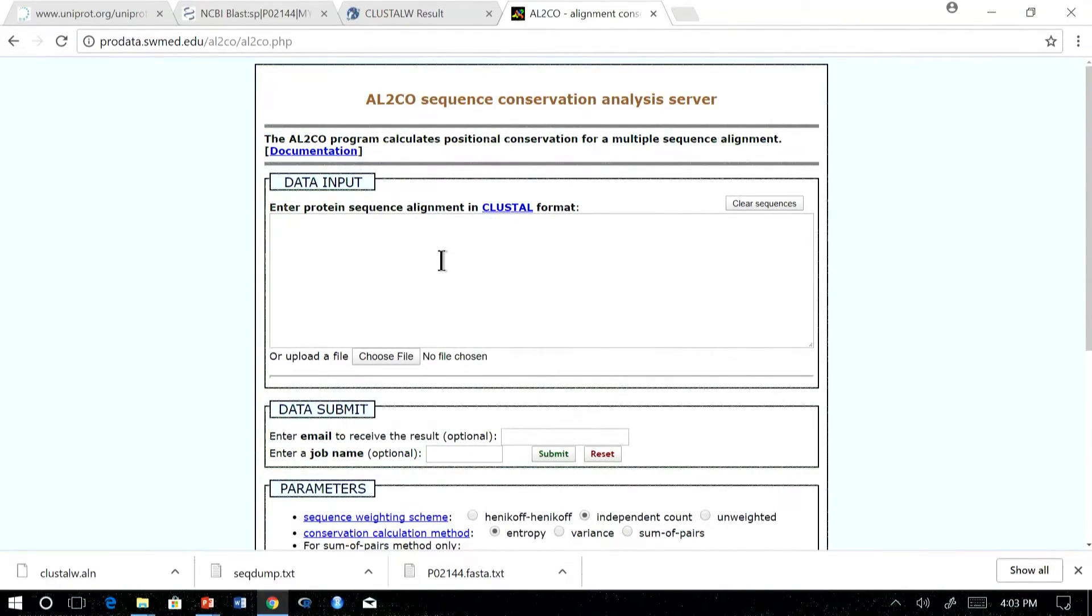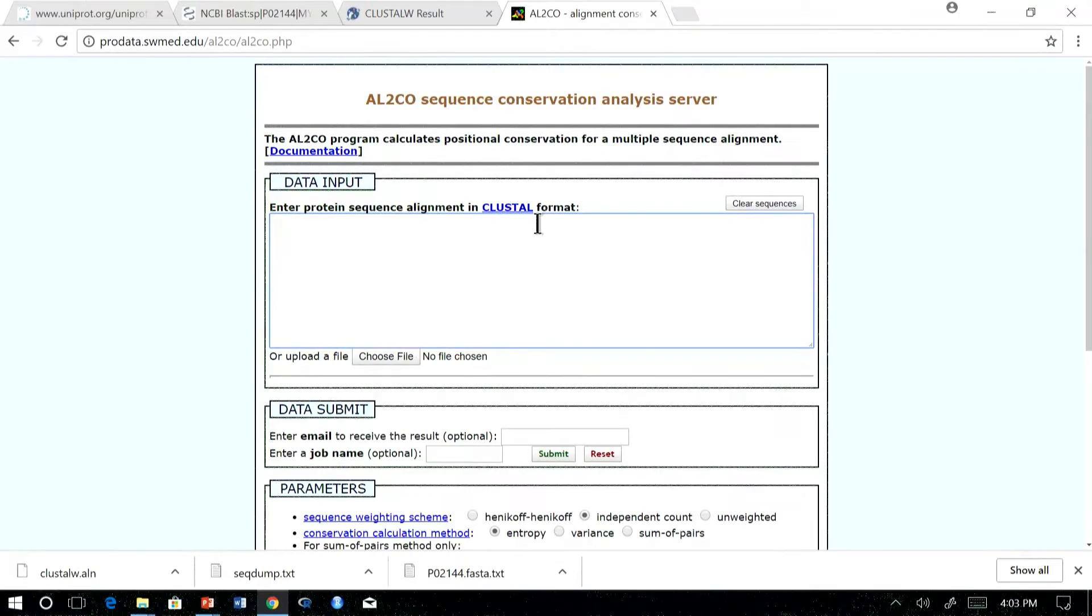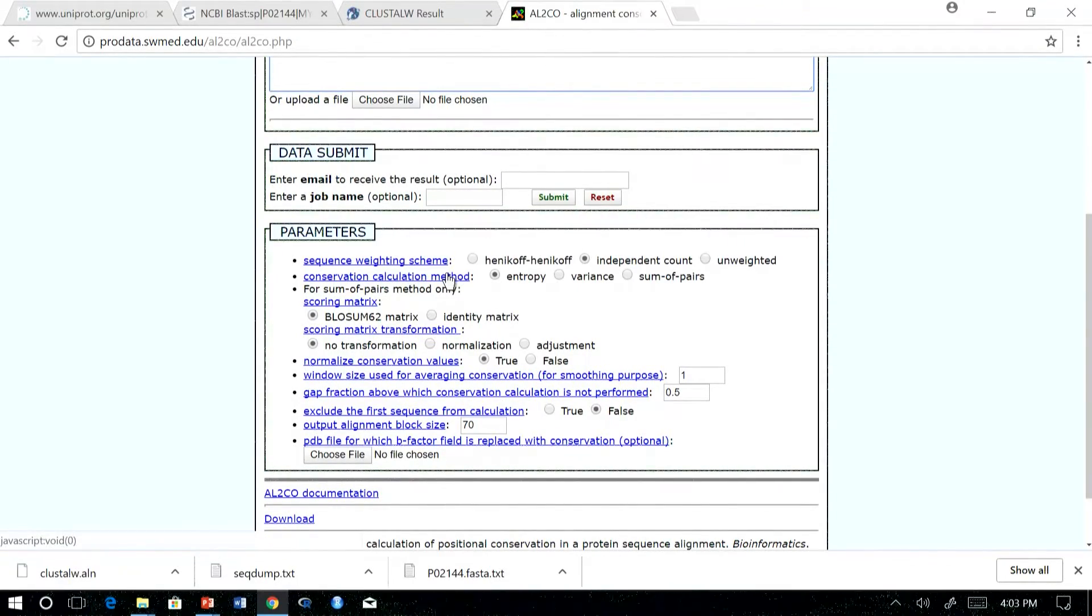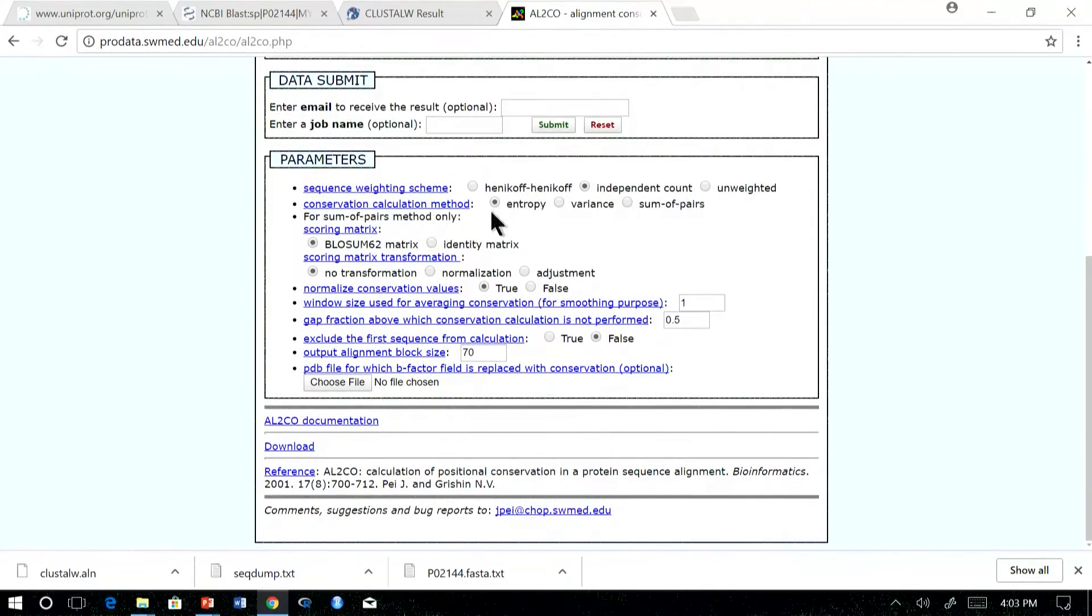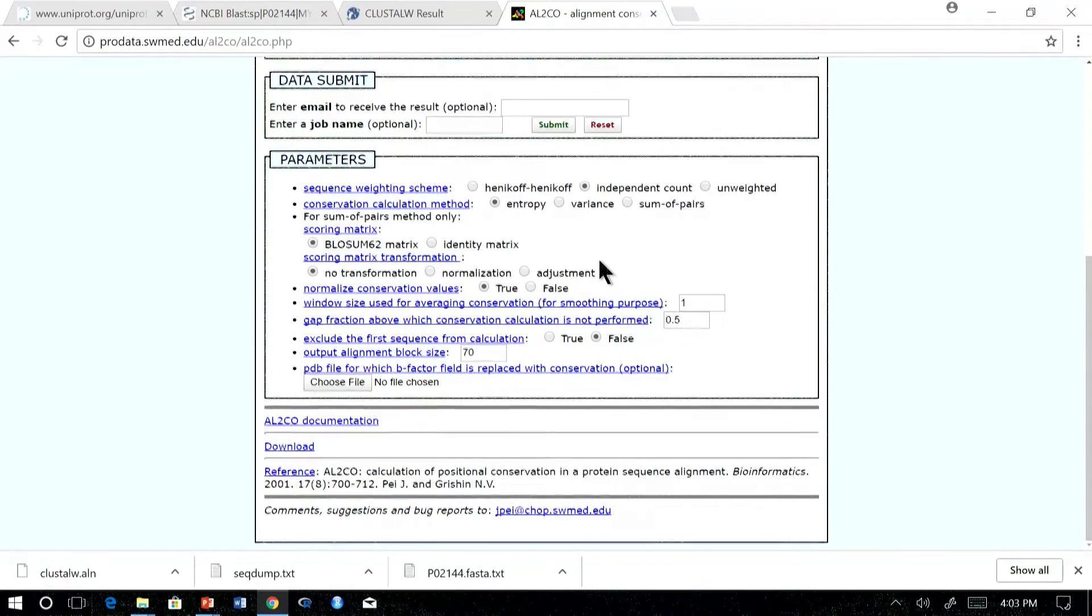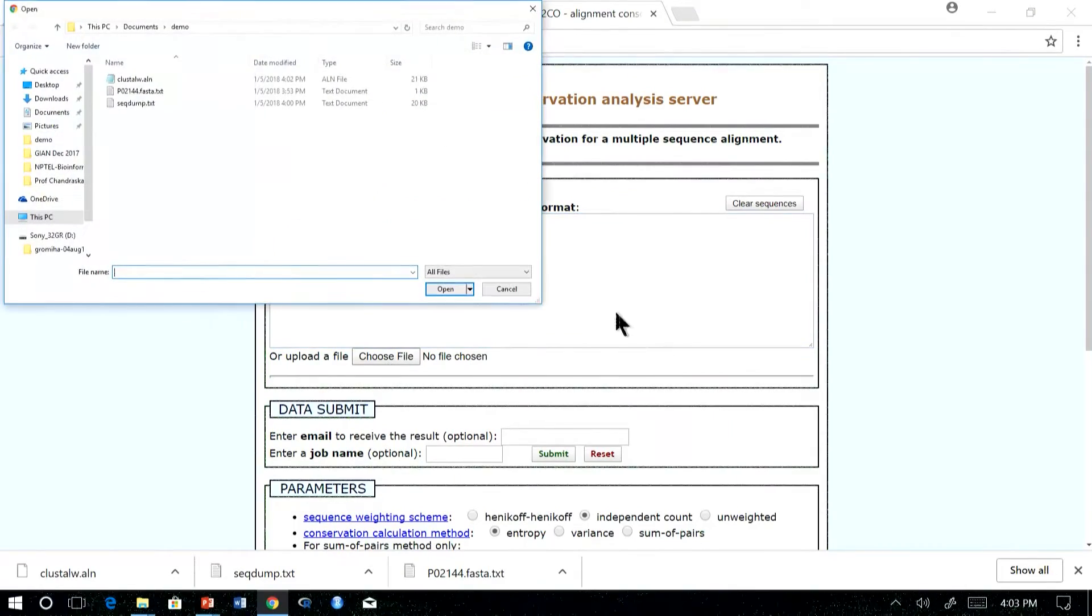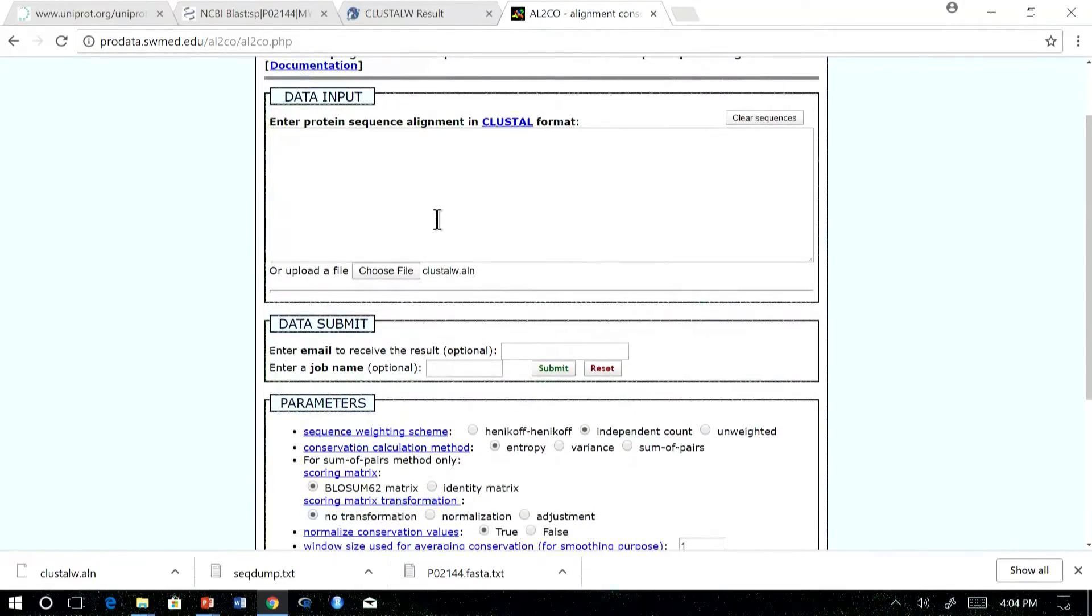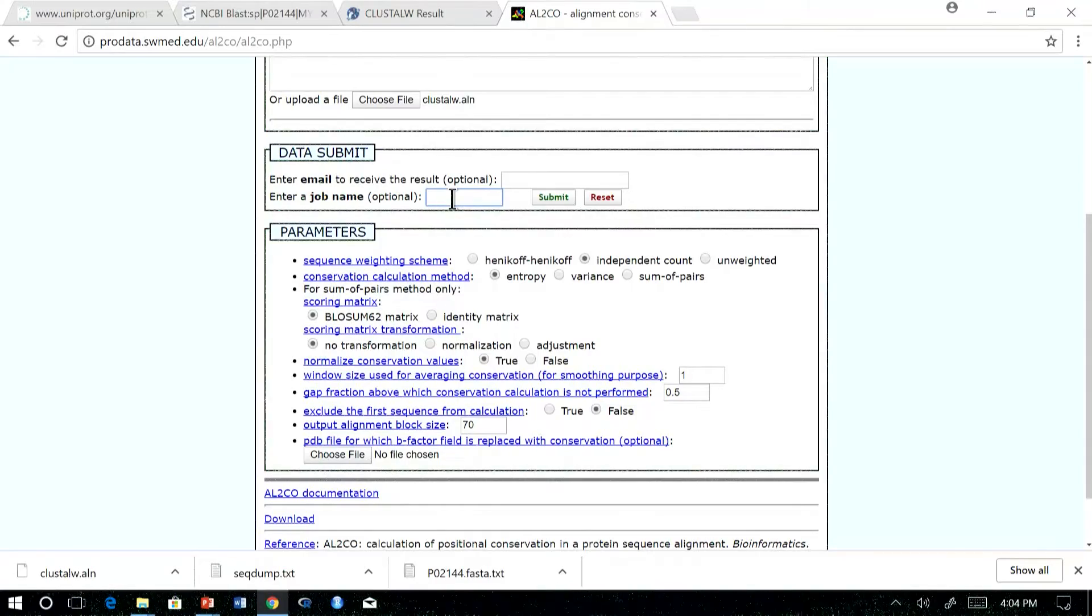This is a web server AL2CO. AL2CO is used to calculate the sequence conservation score. It provides a lot of flexibility. We can choose different weighting schemes and entropy conservation methods, which we learnt in the class. We can also choose BLOSUM matrix or different matrix and different normalization ways. To begin with, let us give the data input, which is aligned clustal format alignment.